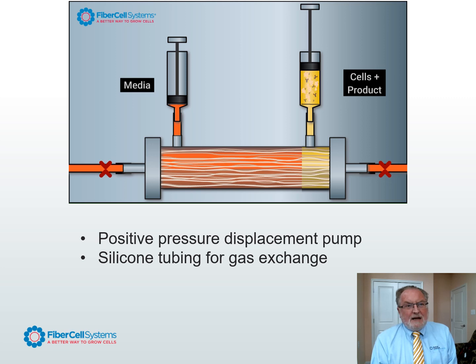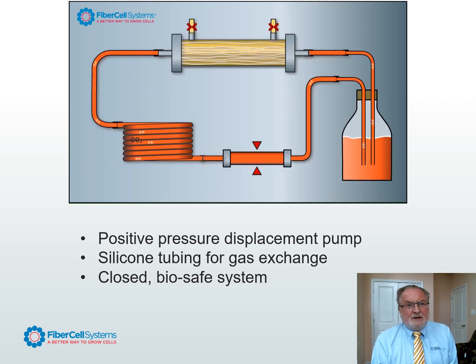The silicone tubing for gas exchange means the system is a sealed, closed system. It's effective for being a biosafe system and allows us to culture cells for many months or longer.